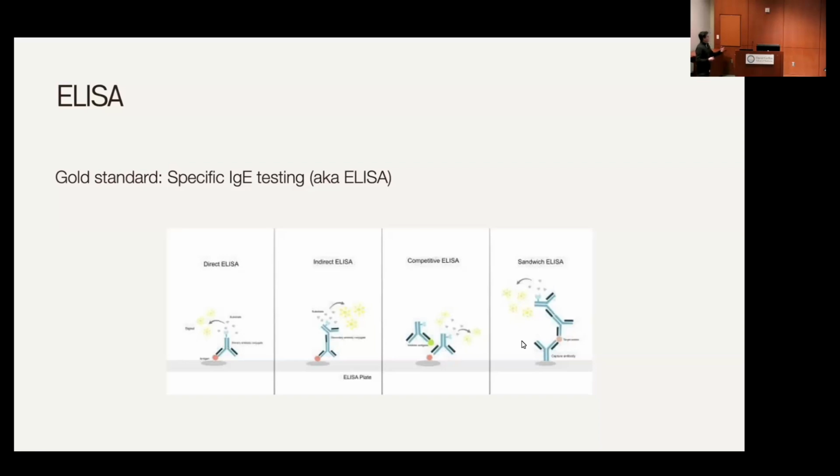If the enzyme-linked antibody binds to the antigen at the bottom of the well, we can introduce substrate, and then we can go ahead and quantify how much light we have, and that will tell us how much antigen we have, because that enzyme-linked antibody is directly bound to the antigen. If we don't get any change in color or light, then that means all of the enzyme-linked antibody was washed away because it had no capacity to bind to the antigen, and we get a negative test.